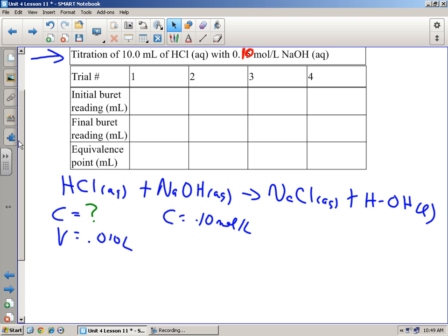In this particular question, it does matter because I've told you that we're going to use 10 milliliters of hydrochloric acid. So, we're not going to put the acid up here because this measures volume for me. You'll understand once we get a little bit further. I have a measured volume. I want that to be my aliquot. So I want to put 10 milliliters of acid into here. Now, is it possible to switch this experiment around? And the answer is, oh yes it is. I'll give you some examples later on how you can switch stuff around and still find the information that you need.